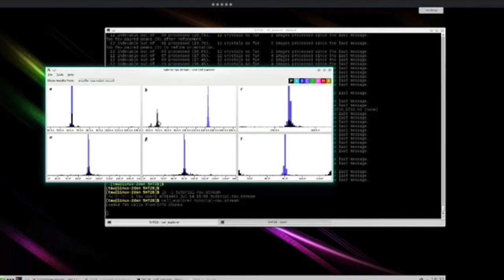Note also this other one. So let's select this peak here. So now again it's clear. This looks like a monoclinic primitive cell. You get both the obtuse and the acute angle representations here. So these are equivalent. But probably what's happening here is this is when the indexing algorithm just didn't quite realize that the unit cell was actually orthorhombic C-centered and just gave you the monoclinic primitive one. It should be absolutely equivalent. I admit I haven't checked whether that cell actually agrees with the orthorhombic one if you apply a suitable transformation. It could also be that it's a contaminant.